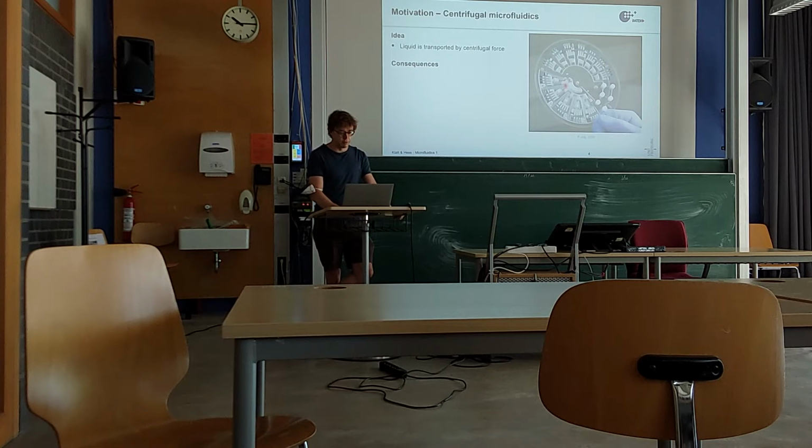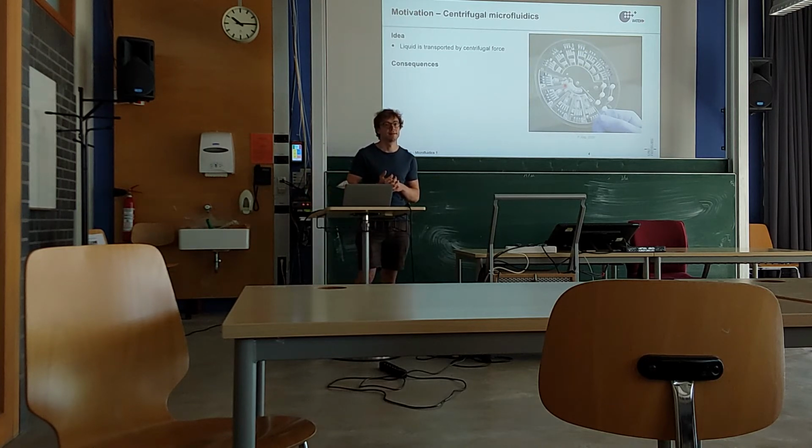So if you now compare this with the concepts that Niklas presented last time, what could be a consequence, what could be an advantage if you think about this idea of transporting liquid? Any ideas? Yeah? There's no need for pumping the liquid? Right.